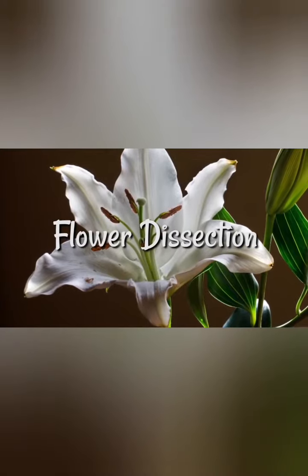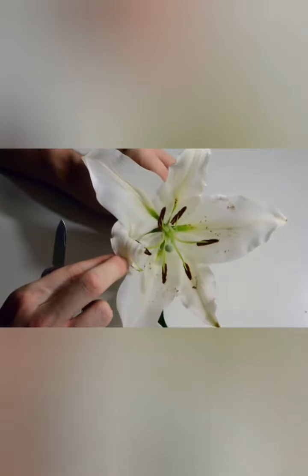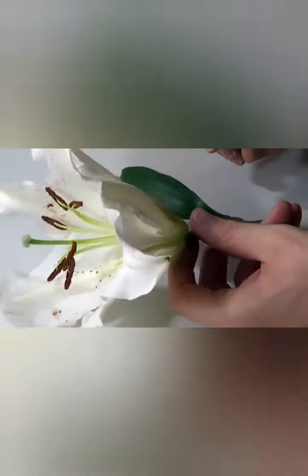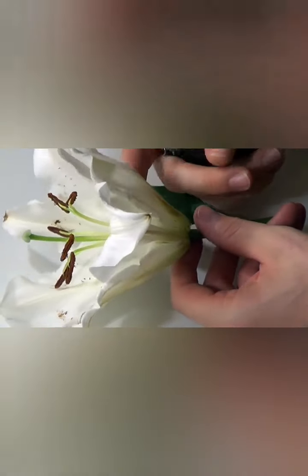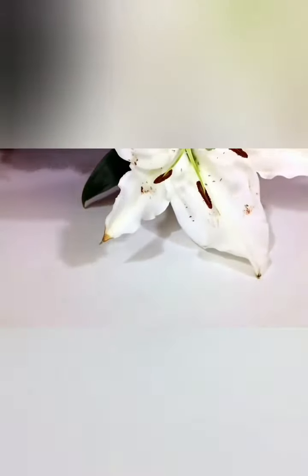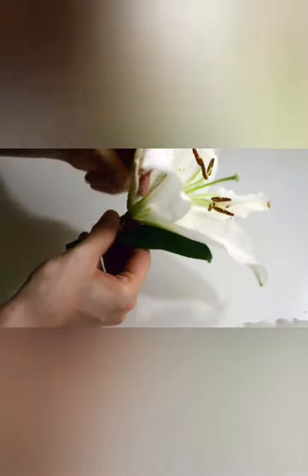For this flower dissection, we're using a lily because it's a really large flower that's got really obvious and very distinct reproductive parts. Now the first thing that we're going to do is remove this outer layer here. These are the parts known as the sepals, and you can see there they are the first thing that comes out at the top of the stem of the flower.